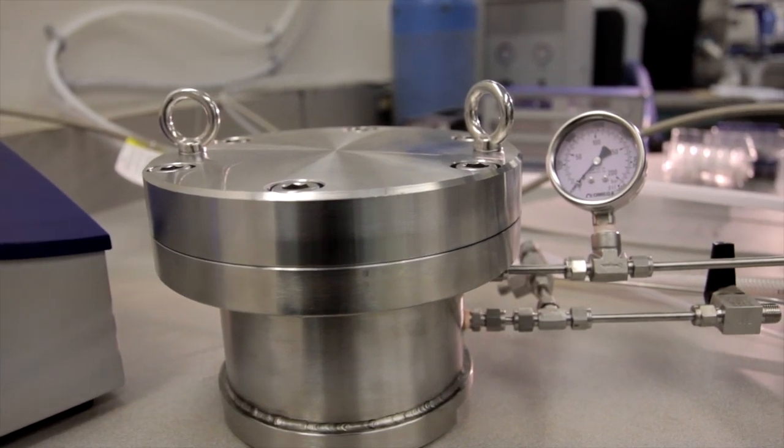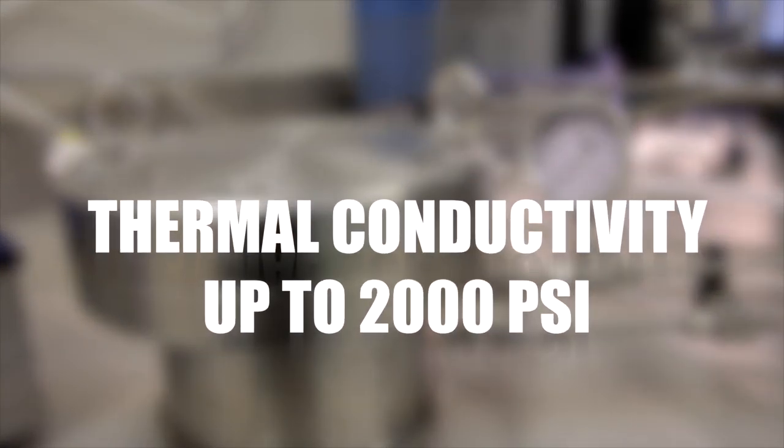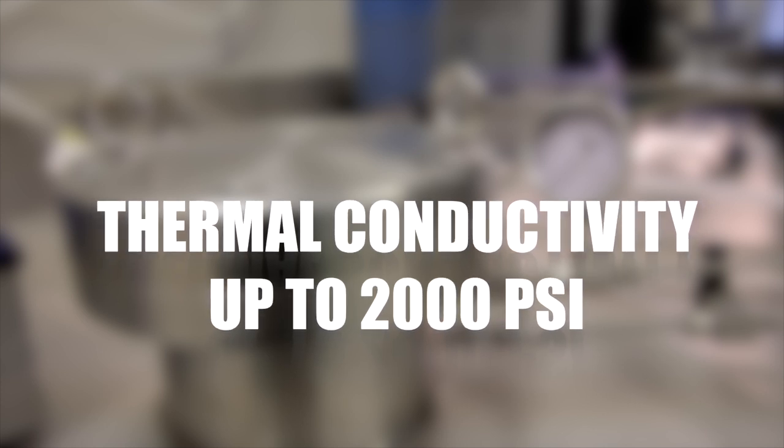Of particular interest to the energy sector is the new high-pressure cell that empowers researchers to measure the thermal conductivity of materials up to pressures of 2,000 psi.